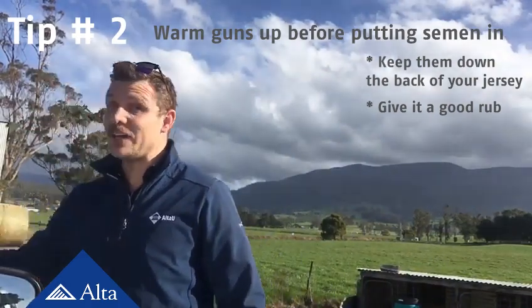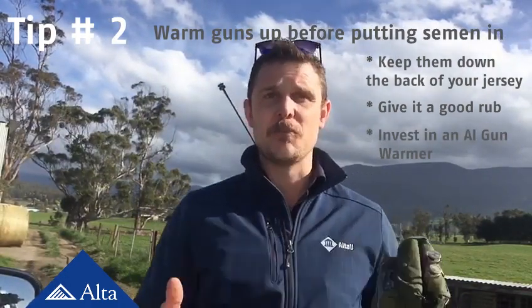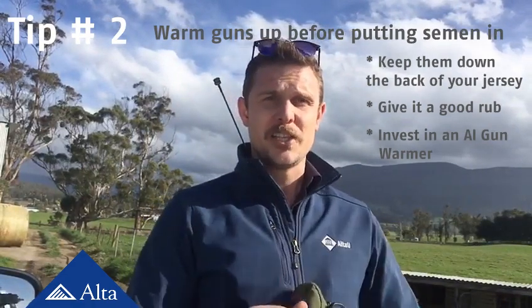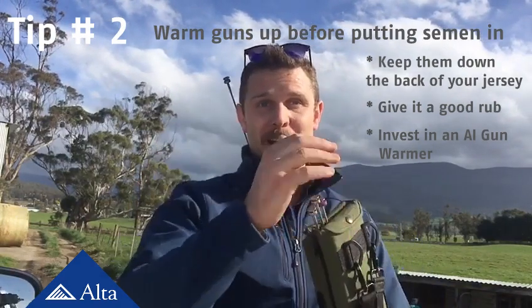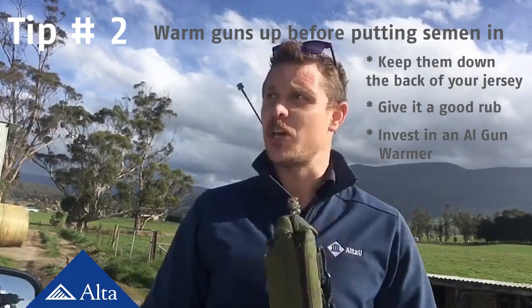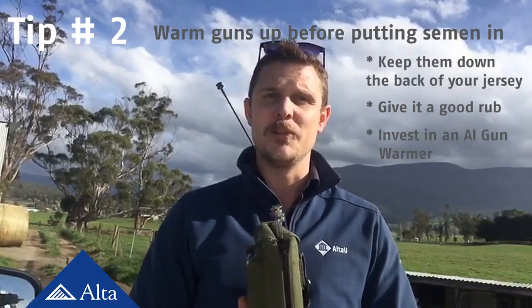Thirdly, invest in an AI gun warmer. These things are really good — you just flick them on, wait until the light stops flashing, which means they're at the right temperature. Stick your guns in there and wait until they're nice and warm before you load them, and also after you've loaded them put them back inside to keep them at the right temperature until you need them, and to keep it covered away from any dirt or anything in the atmosphere which might affect the fertility of that semen.